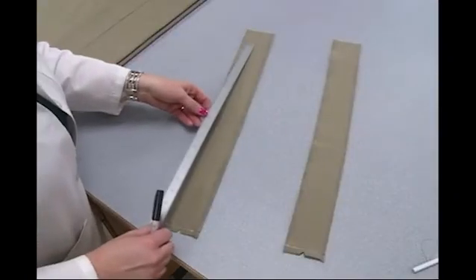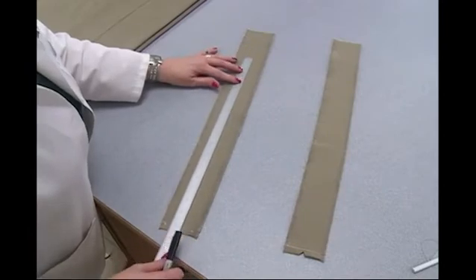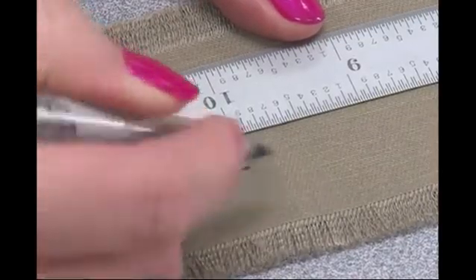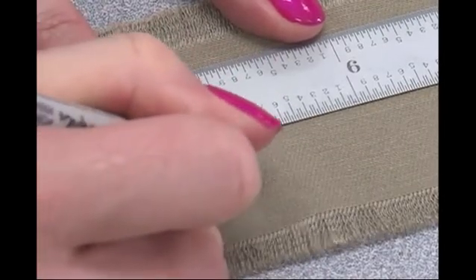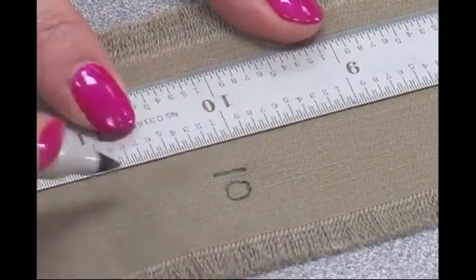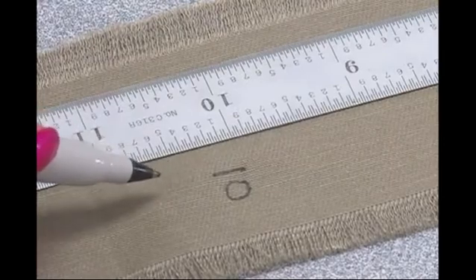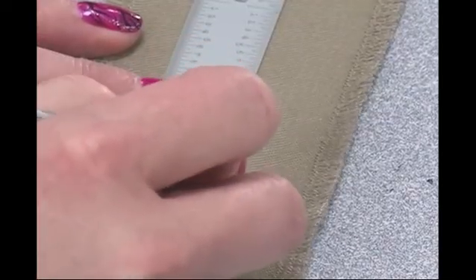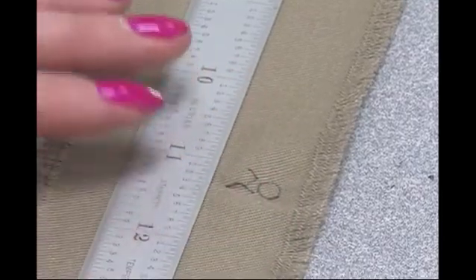While the specimens are flat, 10-inch benchmarks are placed in the middle section along the long dimension of each specimen. This represents the original distance on which the measurements of both the stretch and growth under a specified tension will be based. Some laboratories use a 20-inch benchmark length.